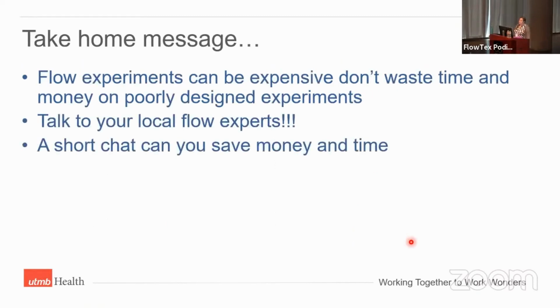And my biggest take home message, which I think pretty much any flow core would tell you, is flow experiments are very expensive. And it's not just the flow antibodies or the flow time that it's expensive. It's the time that it takes you to get to the flow instrument. Don't waste your time and your money on a poorly designed experiment. We are here for a reason, so please talk to us because we will help you, we will save you money, and your science will be saved for it. A short talk can go a really long way.